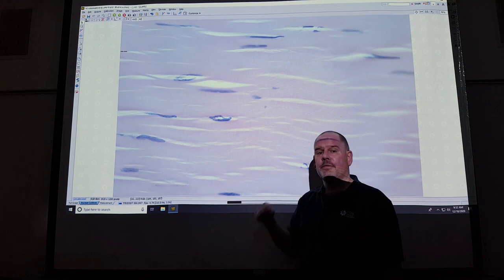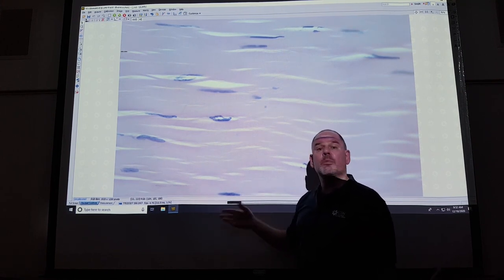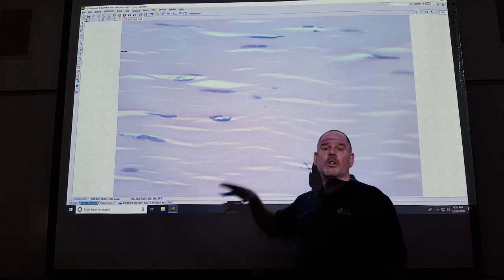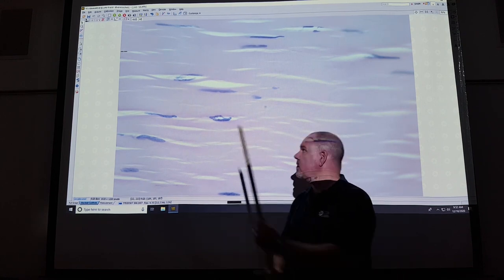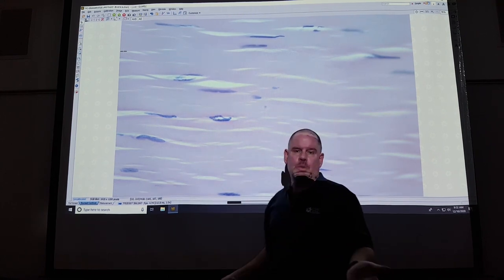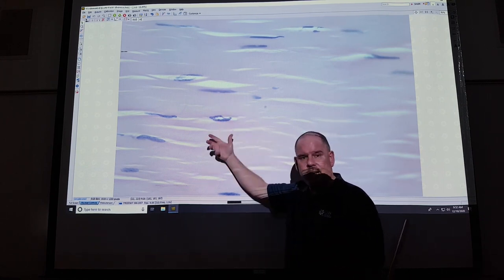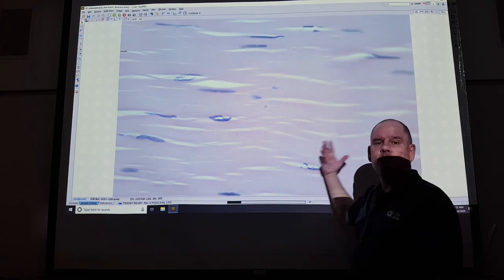Contrast this with our first tissue that you saw in lab today, areolar, which is sometimes called loose or irregular. So areolar was loose, the fibers were not this tightly packed. It was irregular because they were pointing every which way. Here, the fibers are close together, dense. The fibers generally run in the same direction, regular.